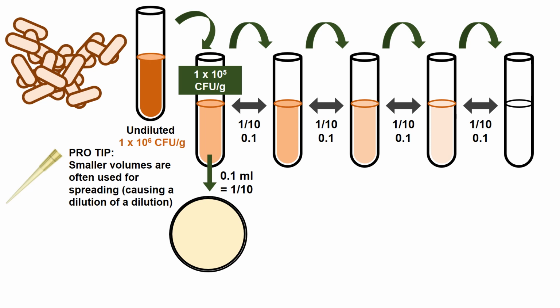It's a tenth less. 5 powers of 10 becomes 4 powers of 10. You have 1 times 10 to the 4th CFU, not 1 times 10 to the 5th. See how the volume that I spread on the plate made those numbers change? Good, because you're going to do variations of this both in the online worksheet and in the in-class exercise.